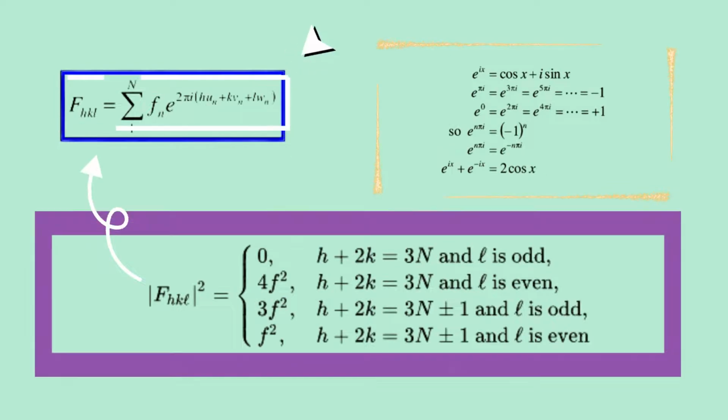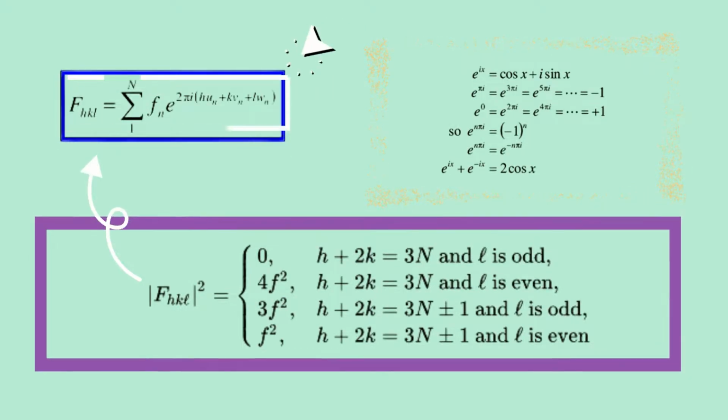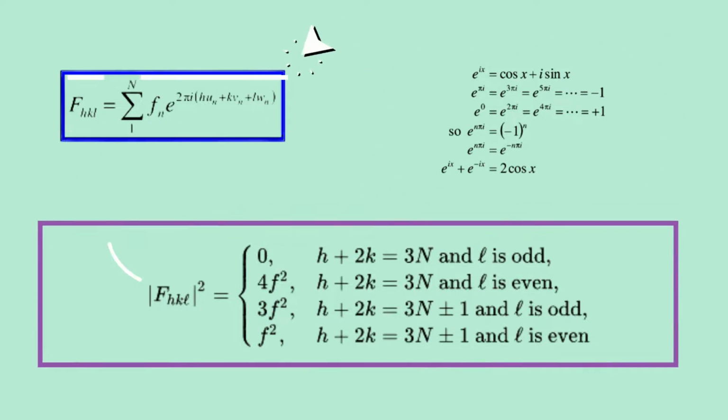The unit cell scattering factor is called the structure factor, F. The formula is written as shown in the box. It shows that intensity is proportional toward the square of structure factor. Presence of additional atoms, ions, molecules can alter the intensities of some of the reflections.